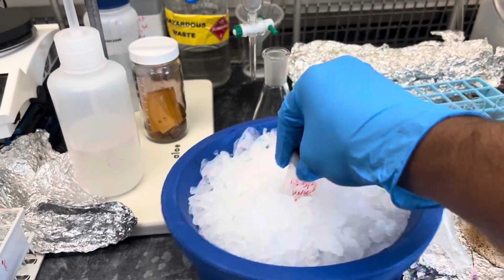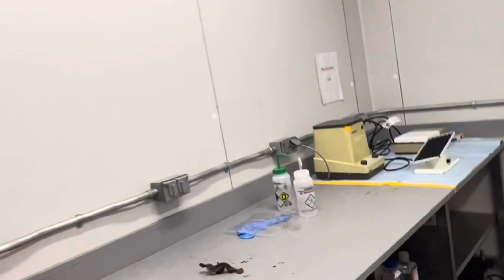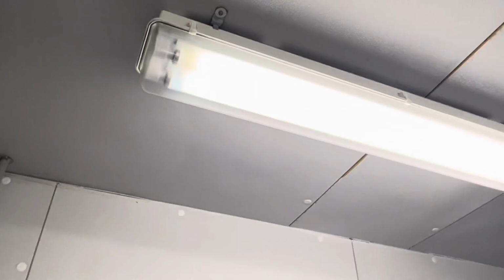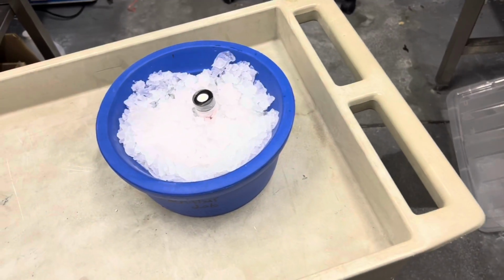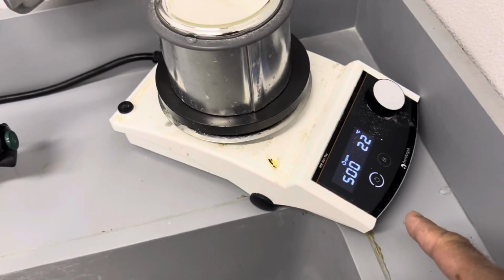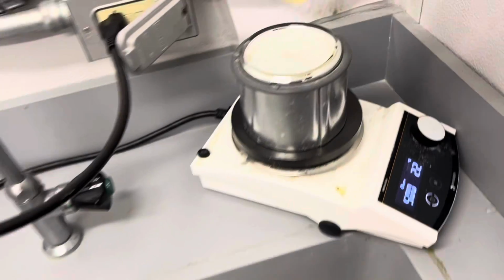I'll keep this vial here, and we have a 0 degrees Celsius room where the temperature is maintained at 0 degrees Celsius all the time. So here is the room, and this room has a cooling system. Here I'm just transferring my vial from the ice bath to another ice bath on a stirring plate so that it can stir. So this is the reaction setup, and the workup is very easy.